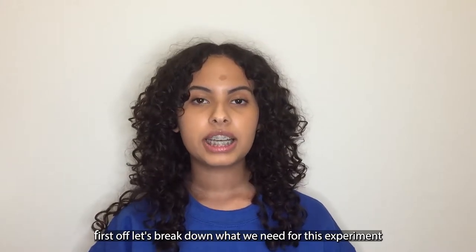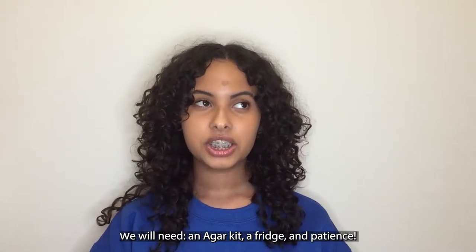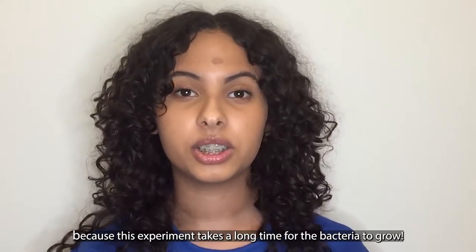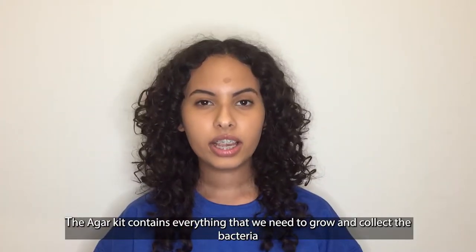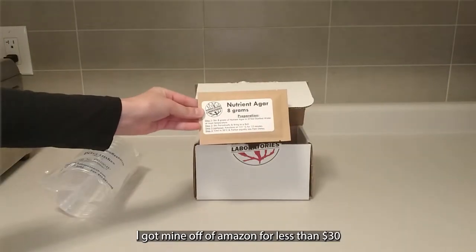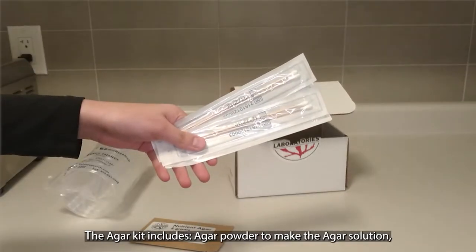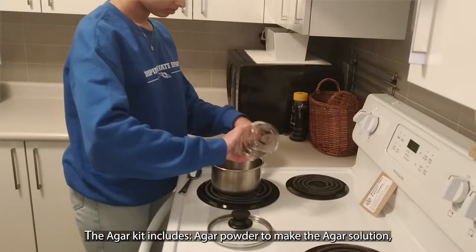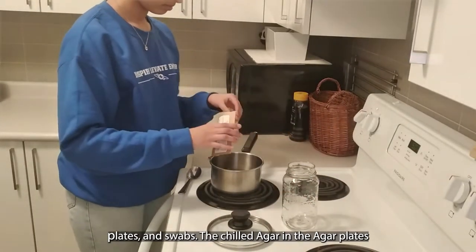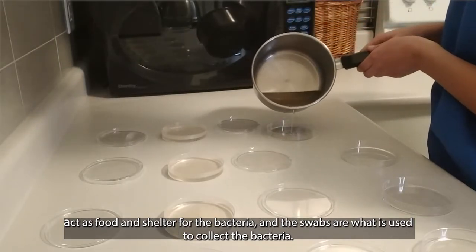First off, let's break down what we need for this experiment. We need an agar kit, a fridge, and patience, because this experiment takes a long time for the bacteria to grow. The agar kit contains everything that we need to grow and collect the bacteria — I got mine off of Amazon for less than $30. The agar kit includes agar powder to make the agar solution, plates, and swabs. The chilled agar and the agar plates act as food and shelter for the bacteria, and the swabs are what is used to collect the bacteria.